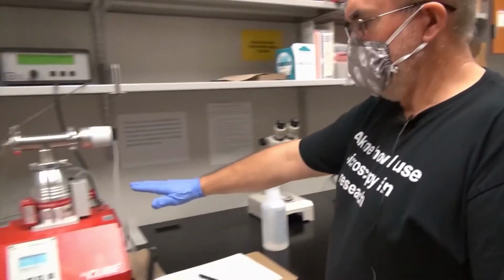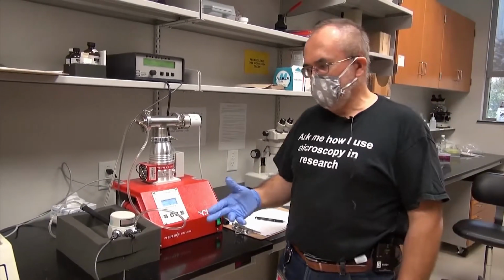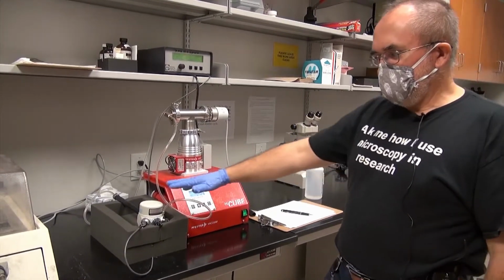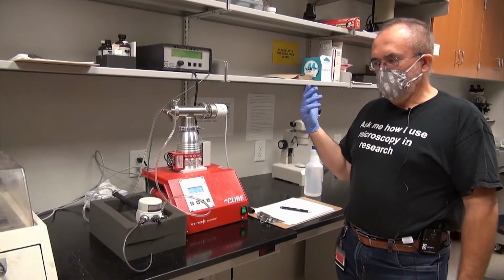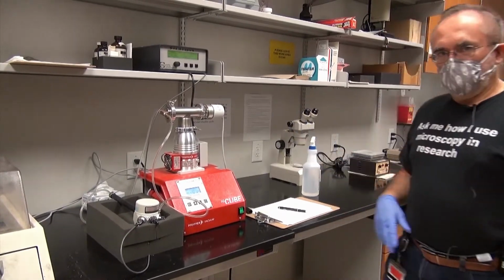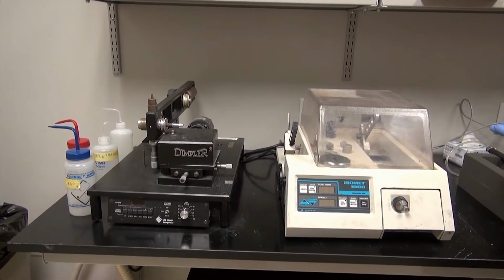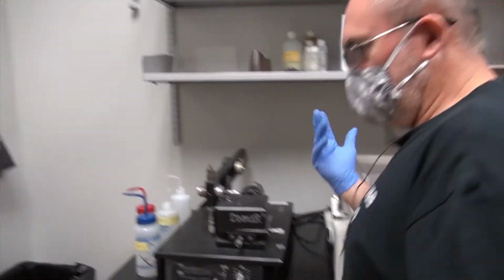And over here is our pumping station that holds the Gatan cryo TEM holder. So these holders, when they're not in the microscope, spend most of their life here, and they need to be kept under vacuum and go through the heating cycles so that they can perform up to the specifications. This is a diamond saw and a dimpler, and those are mostly related to material sample preparation for SEM or TEM.